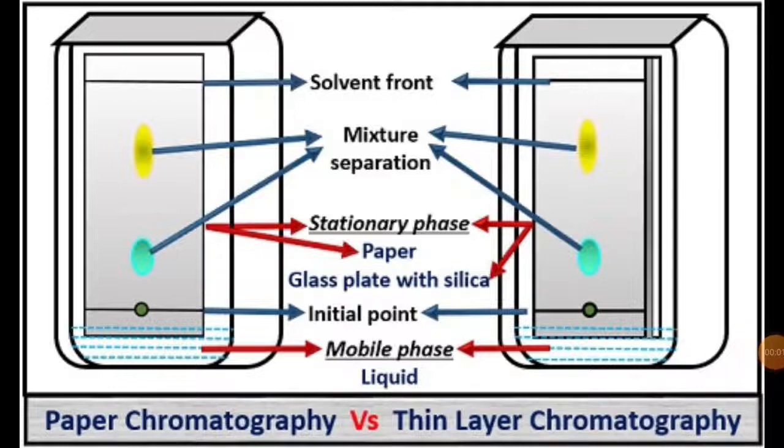Welcome back friends, welcome back to another video tutorial for microbiology with Shatnik. In this video tutorial we are going to discuss paper chromatography and thin layer chromatography together.